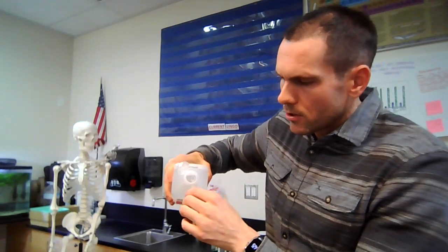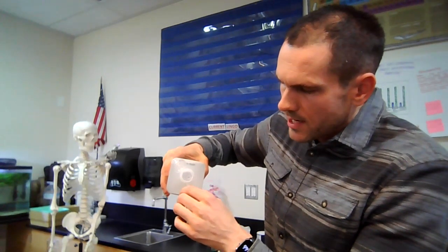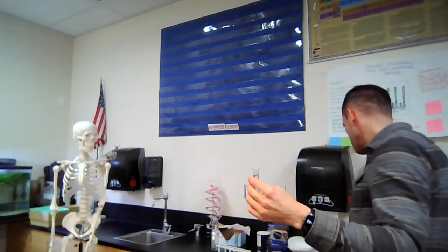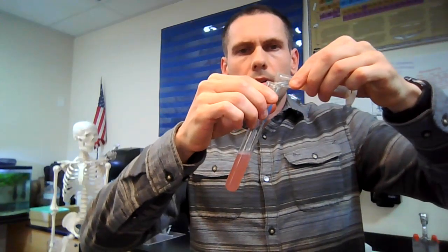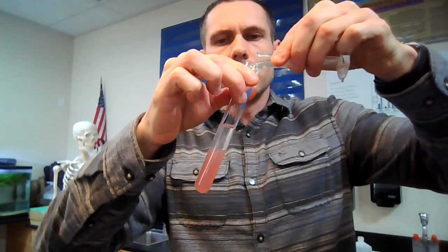You're going to use this little graduated cylinder to measure 10 milliliters, which almost goes to the top. Then very carefully pour that rubbing alcohol into your test tube with all your strawberry goodness.